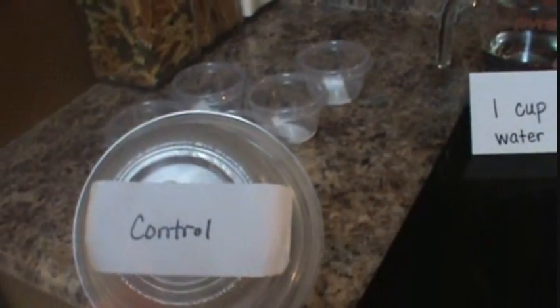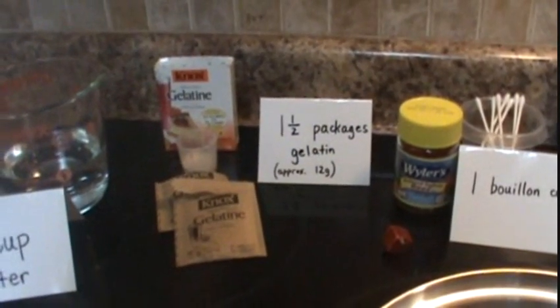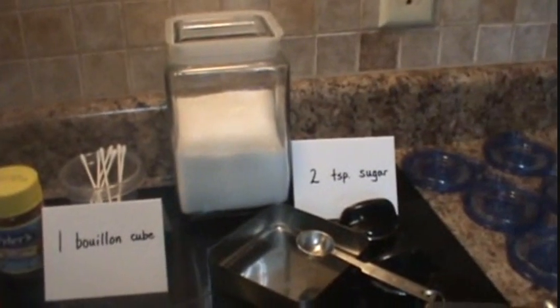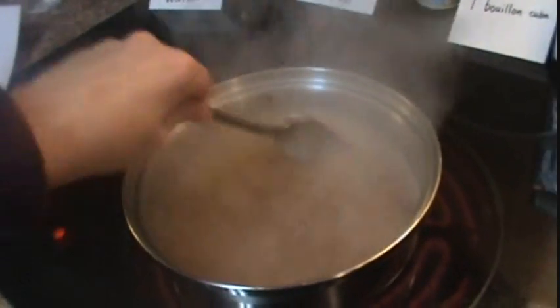First, you need to have several clear containers. The containers need to be labeled on the bottom, and you always want to have a control. Next, we have our ingredients: we need one cup of water, one and a half packages of gelatin, one bouillon cube, and two teaspoons of sugar. You'll take these ingredients and mix them all together in the pan, then bring this to a full boil, stirring constantly.